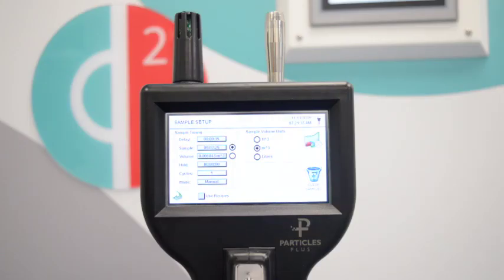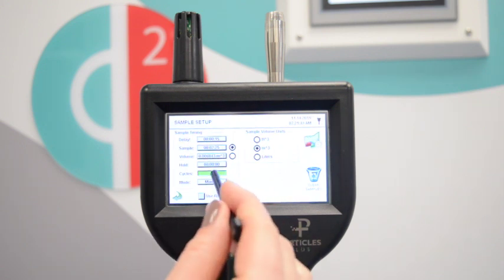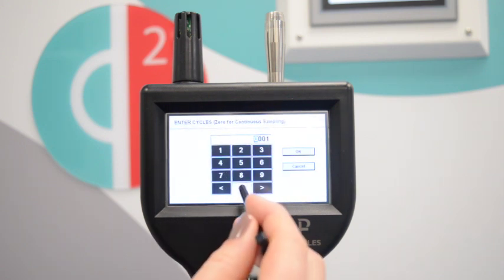To set the particle counter up for continuous monitoring, go to sample setup and enter 0 on samples.